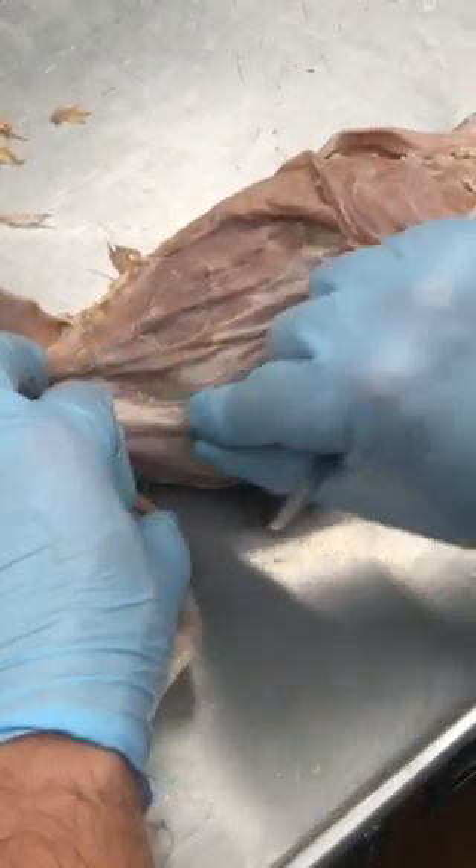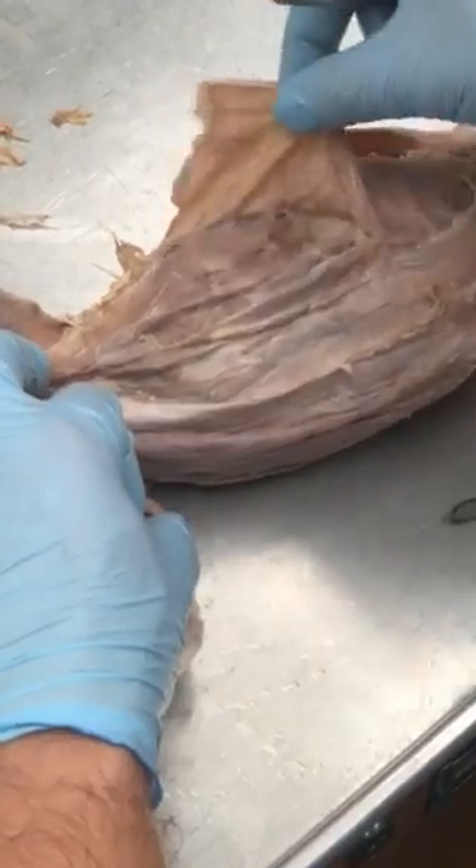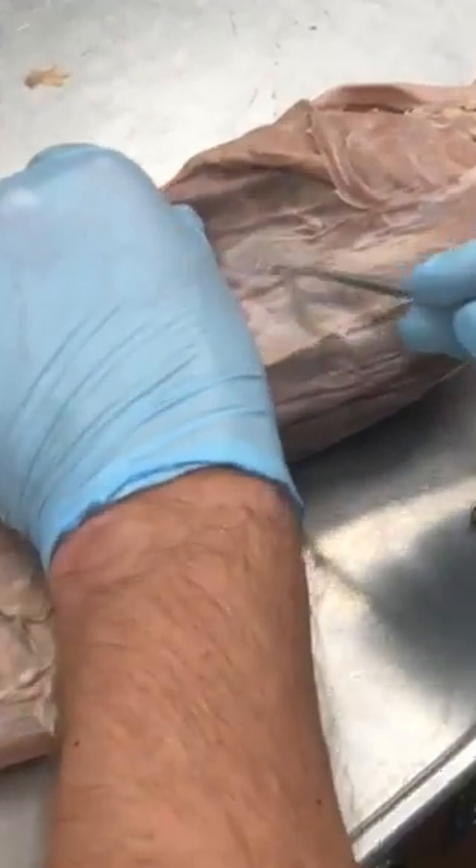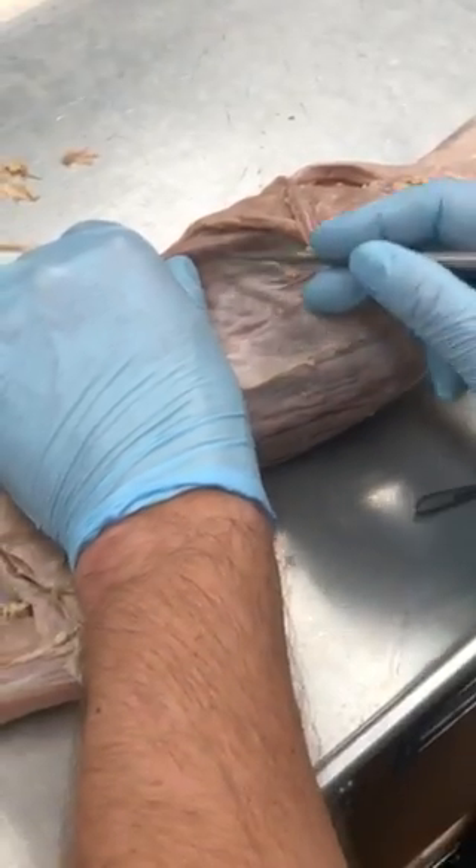So rectus abdominis down the middle, external oblique, internal oblique — this is the transverse abdominis. It's between the oblique and the rectus.